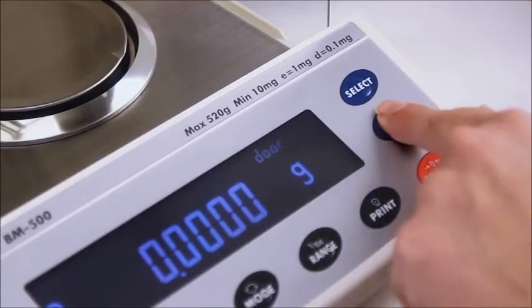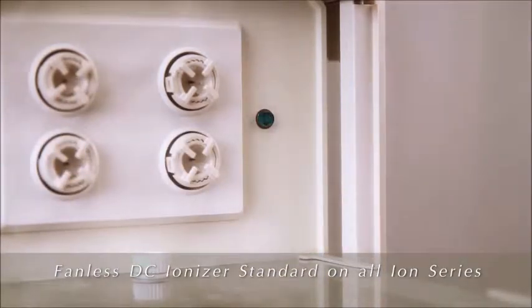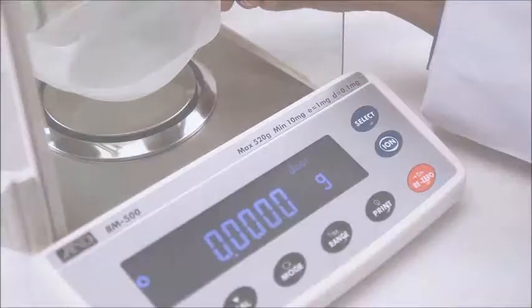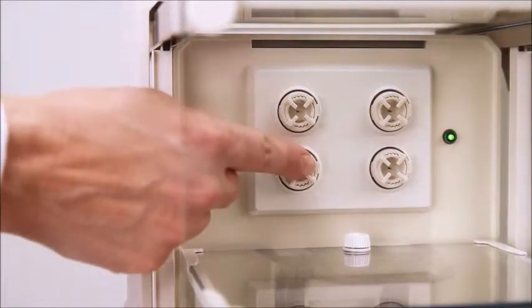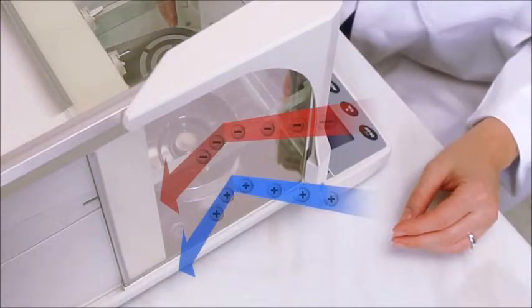To use, just press the ION button and briefly hold the sample in front of the ionizer in the neutralizing chamber to eliminate static. The electrodes last 10,000 hours and are safe to the touch. The weighing chamber and doors are all made of anti-static glass.